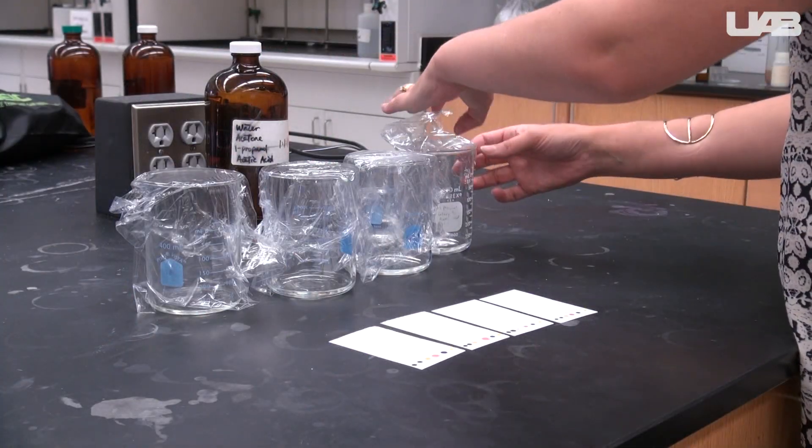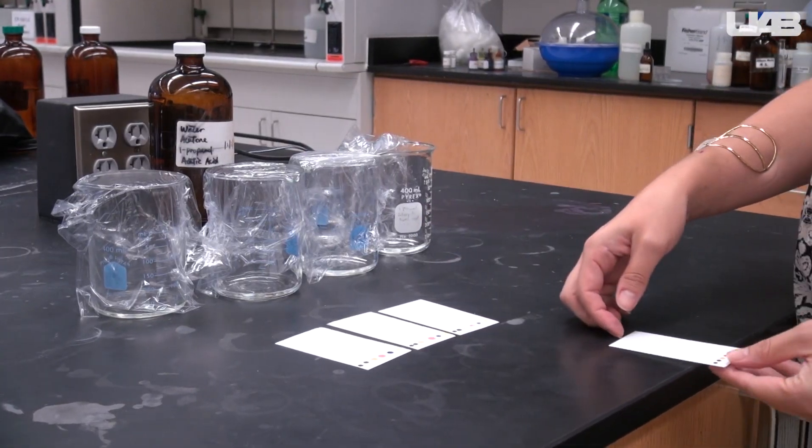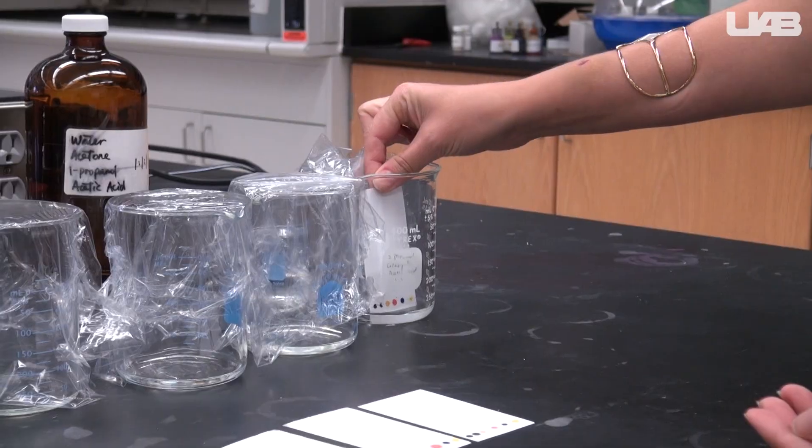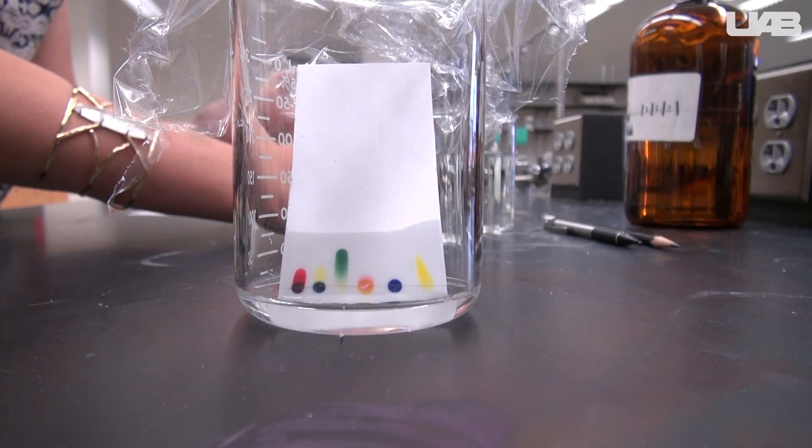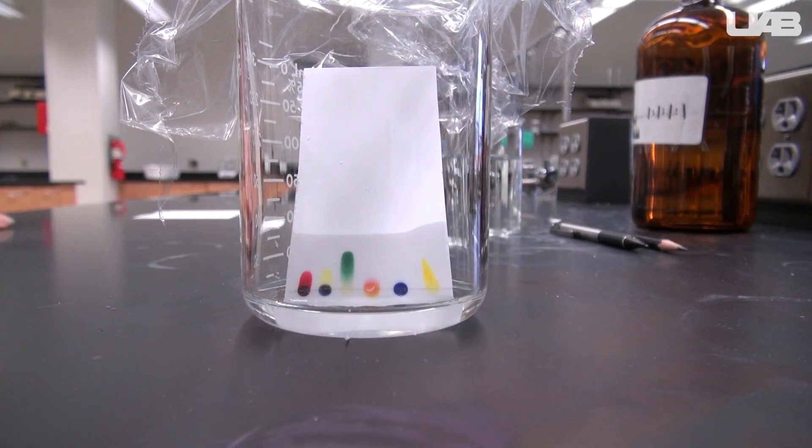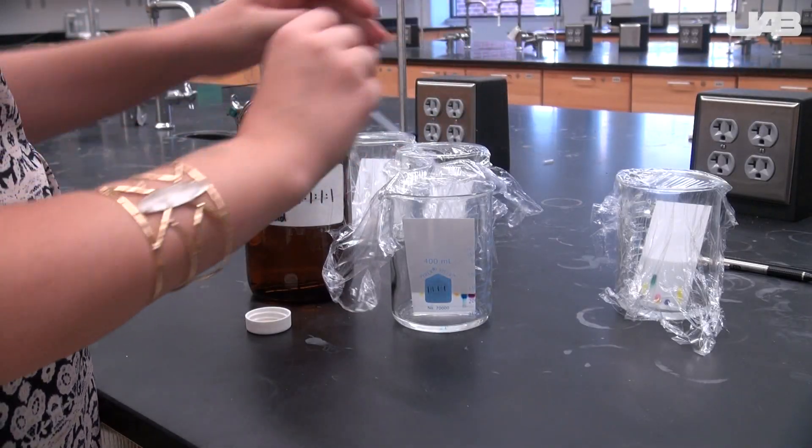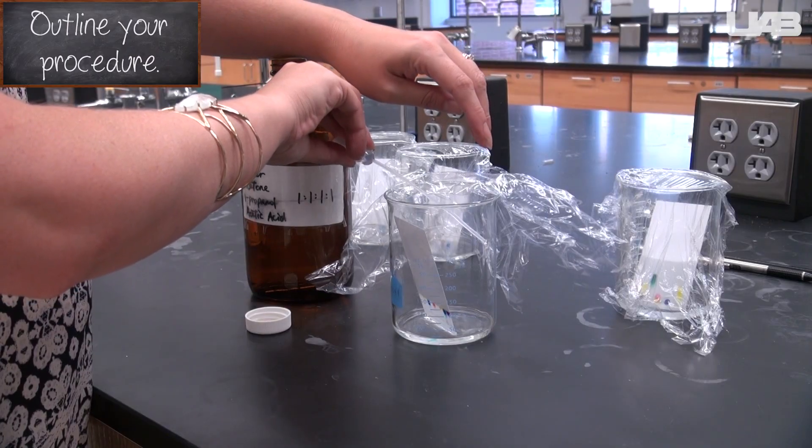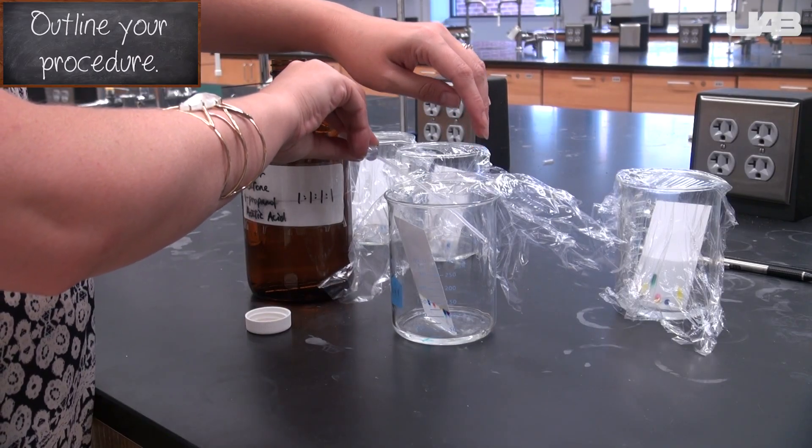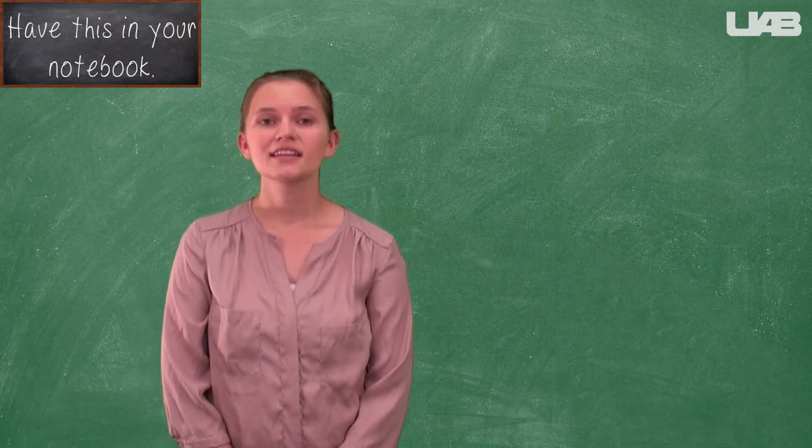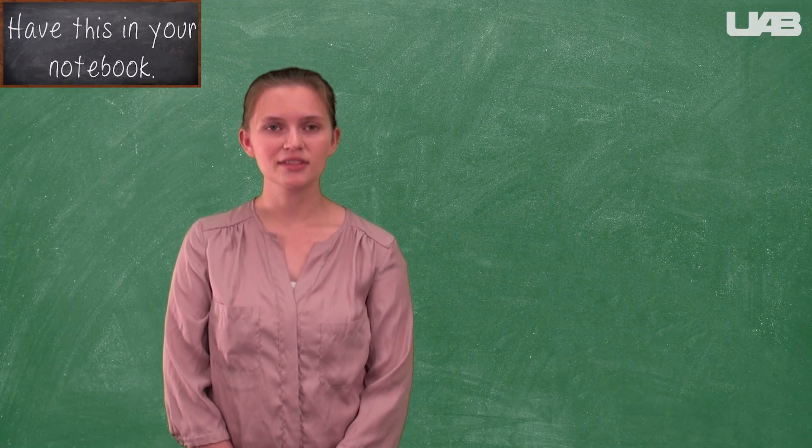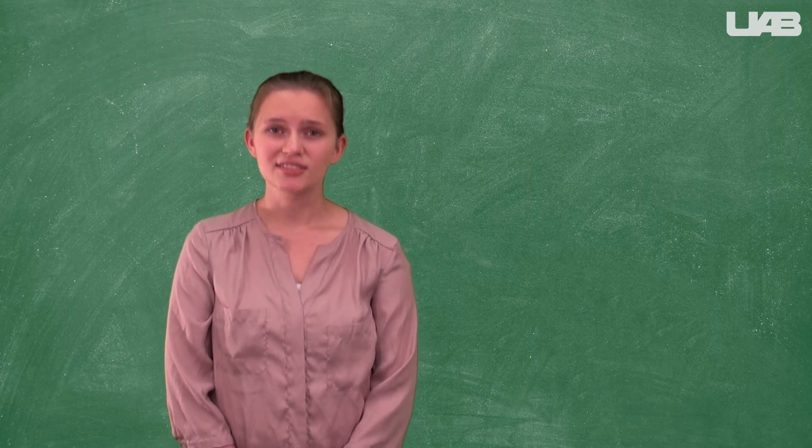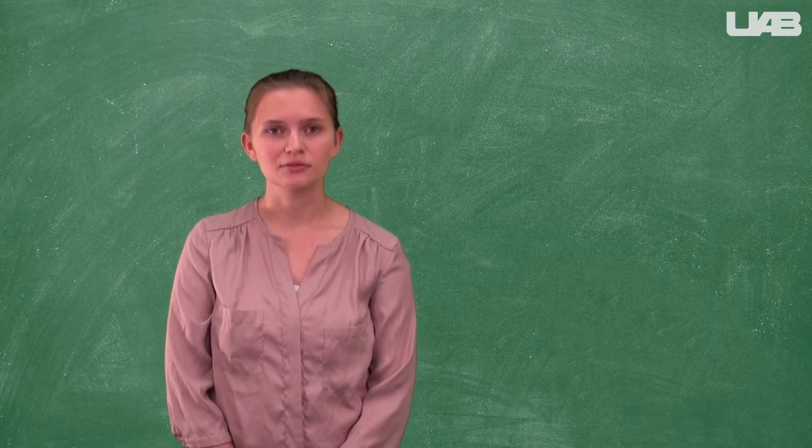Place each plate in a beaker with the spotted line at the bottom. The level of the solvent in the beaker should be below the line you drew with your pencil. The solvent will begin moving up the TLC plate and will carry the dyes with it at different rates. You might need to add more solvent if the level gets low. Simply flip the plate forward so that the plastic part is facing where you are pouring the solvent, so that your stationary phase doesn't get splashed. Keep an eye on the plates and pull them out when the solvent appears to stop moving, or if the solvent is getting near the top of the plate. Your data will not be accurate if the solvent reaches the top.